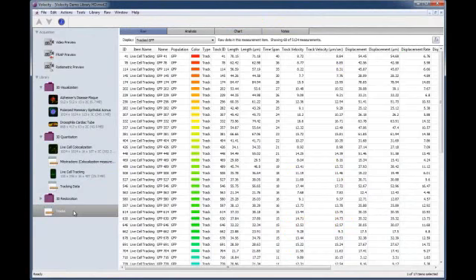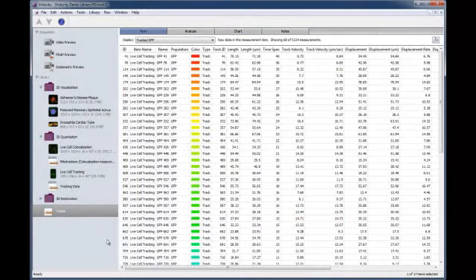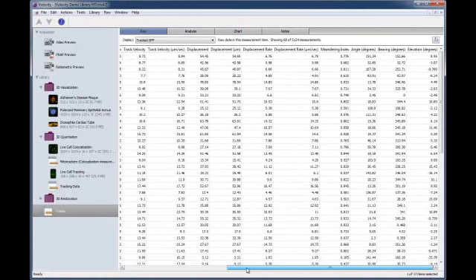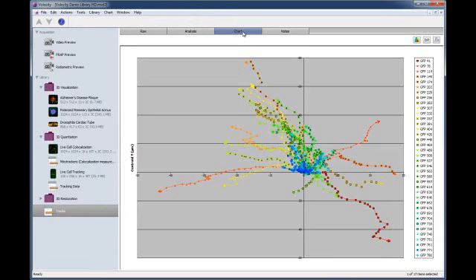The measurement item has different tabs such as Raw, Analysis and Chart. The Raw view shows the same information for objects and tracks as was visible in the measurement view. Click on the Chart tab to immediately show the default representation of track information. Raw tables, analysis tables and charts can all be exported as text or image files.